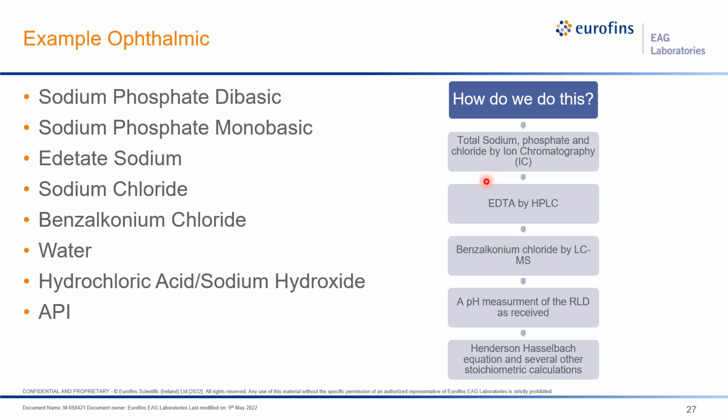Now, the nice thing to know here is that the sodium and phosphate numbers that we have left over after all these calculations should add up. We should have these numbers add up to very similar. Sometimes they're a little bit off. Again, every measurement has an error. But at the end of the day, this is some methodology that we've worked on developing over the years. Again, I'm really proud of this. I worked on this in the lab, and it's something that we have found great success with.